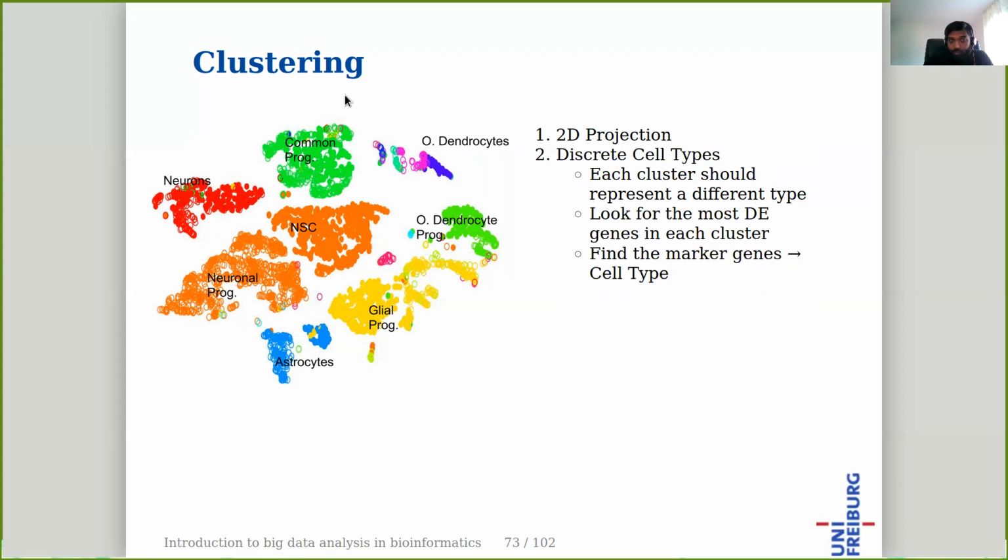to mark which cell types these are, what we need is to annotate that, okay, this is neuronal stem cells, this is astrocytes, this is oligodendrocytes. We need to know first the so-called marker genes. So we need to find out the genes that are highly variable in these clusters, which usually are highly expressed, and which are really the most important genes for such particular cell types.